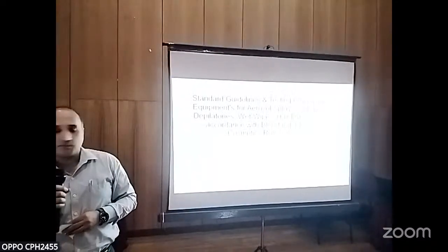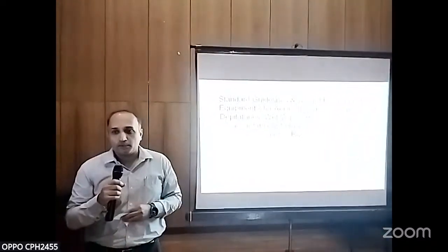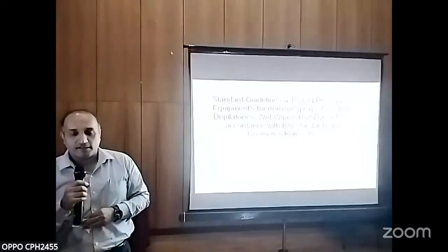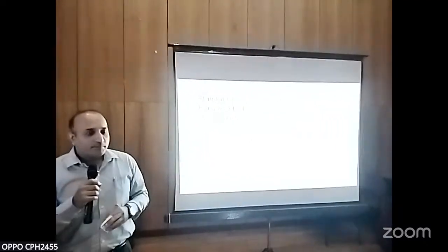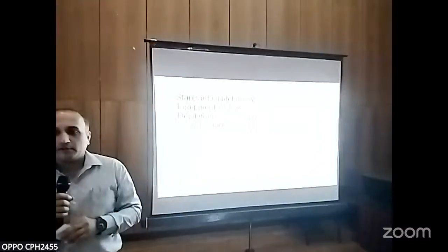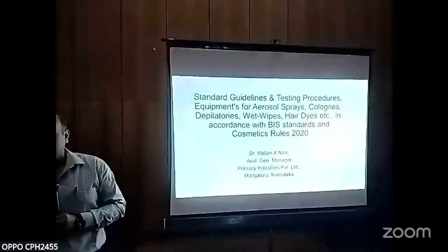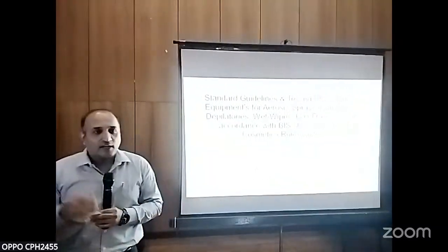You already had two wonderful sessions where the speakers enlightened you in depth about some of the very common cosmetic analyses, specifically heavy metals and micro testing. I won't be digging deep into all of that, but I will make an effort to enlighten you on how a particular cosmetic is sampled in all these categories and how some of the critical analyses are being aligned.